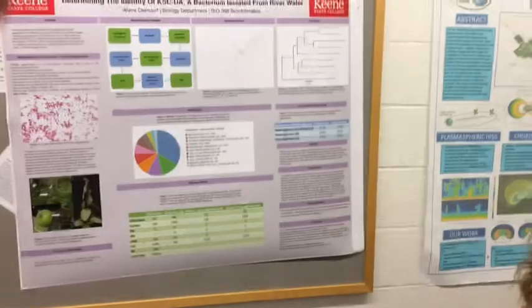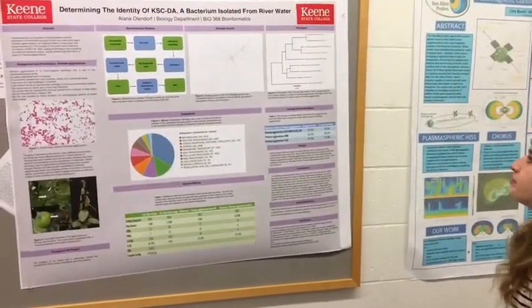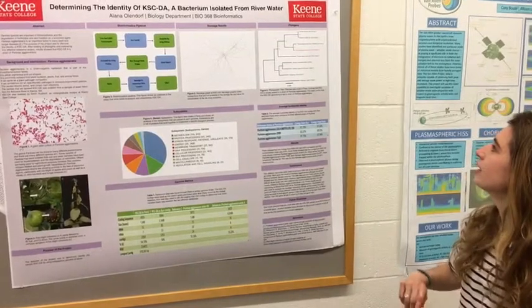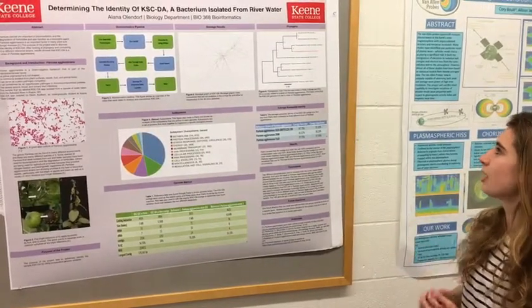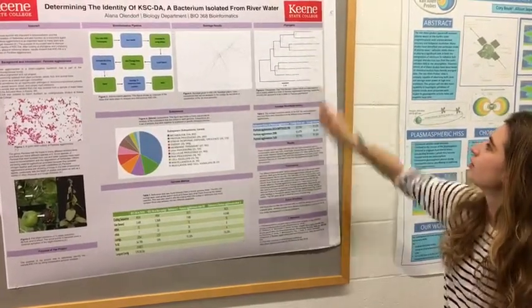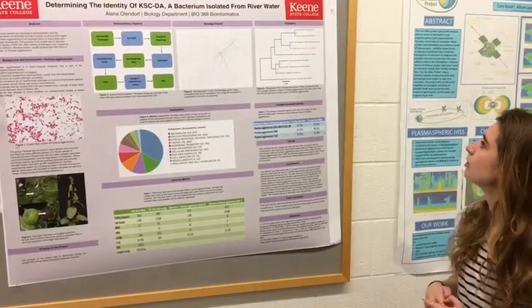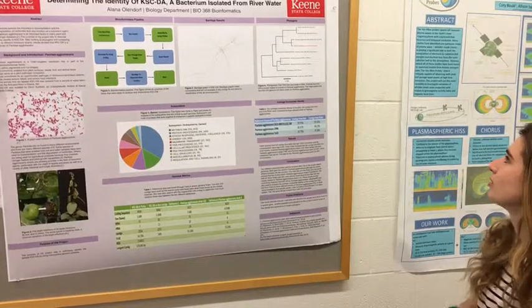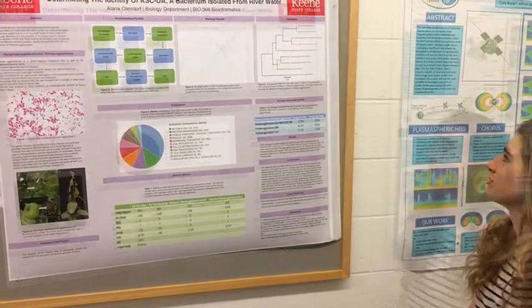And we also used Patrick to make a phylogeny chart, and it had the contigs from my project in here, which is next to a few other different Pantoea species, one strain that was very close to mine.